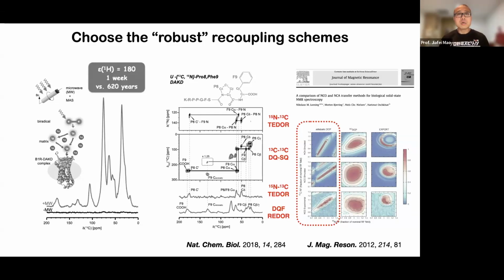But here the choice of the experimental NMR method is very special, because we realized we have very few sample, which means we can't even do optimization of the matching conditions. I actually tested, we need 4 hours to possibly see the signal from the DCP experiment in the 1D mode. And you know, DCP is not very robust, as shown on the right side.